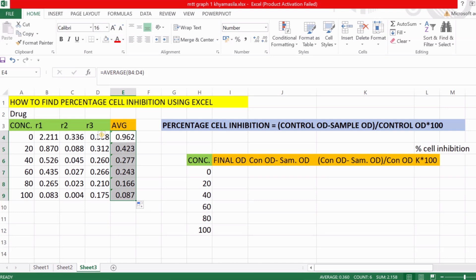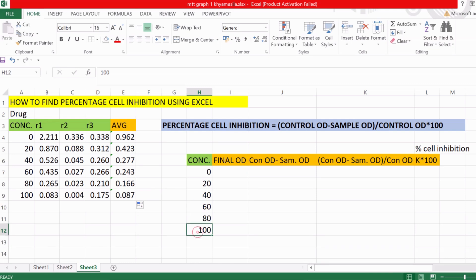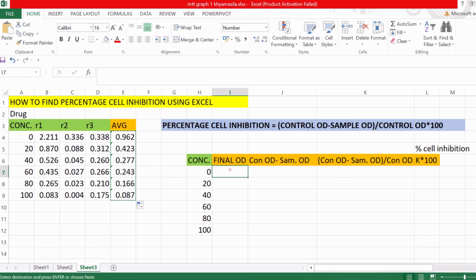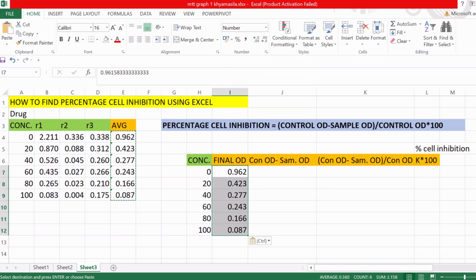Here you can see the concentration column: control, 20, 40, 60, 80, and 100. In the final OD position, we paste these average values. I have divided the formula into three columns: the first is ctrl OD minus sample OD; the second is ctrl OD minus sample OD divided by ctrl OD; and the third column multiplies the whole thing by 100 to find the percentage.